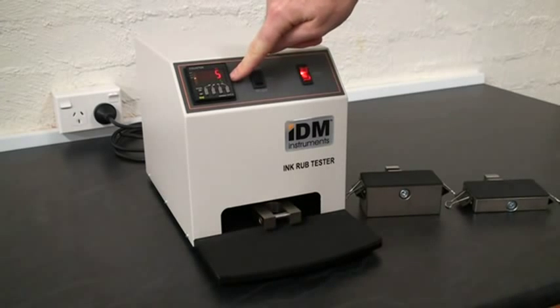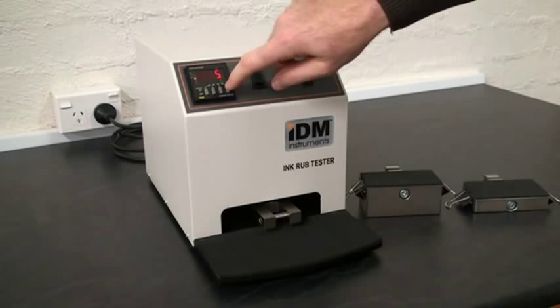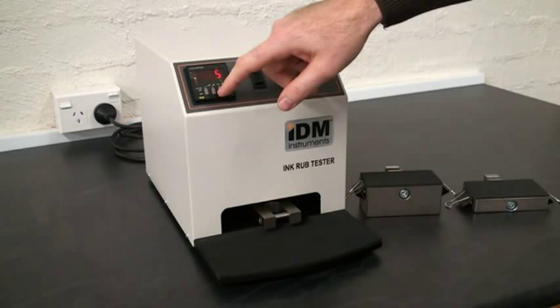Next to there, we have the cycle counter. The cycle counter can be easily adjusted by pressing the keys up or down to increase the desired amount of rubs, which is selectable up to 999,000 rubs.